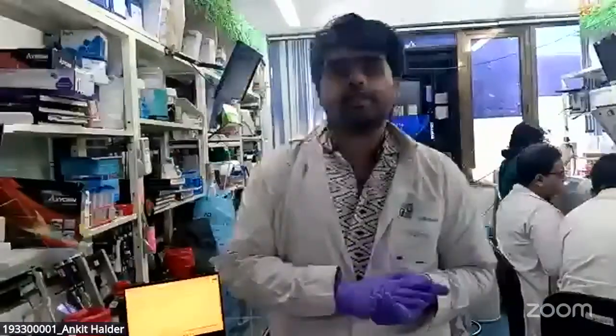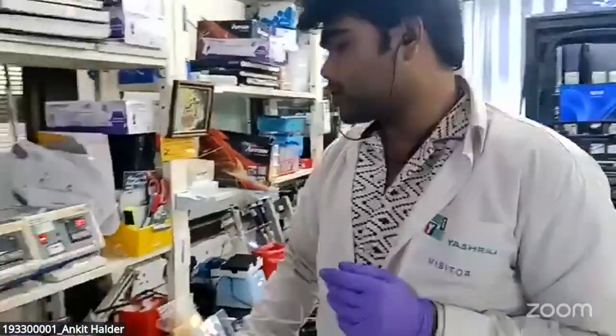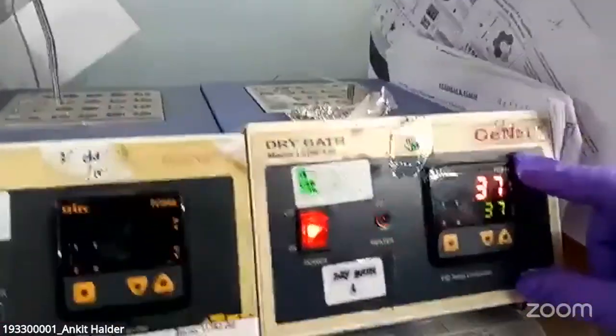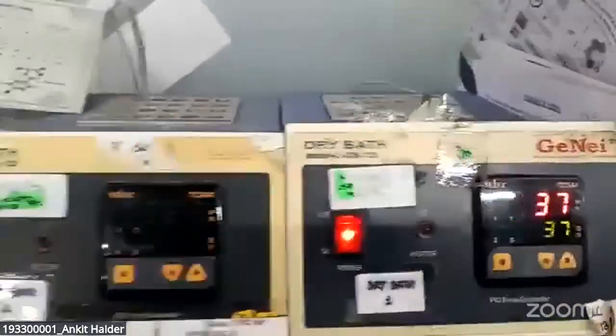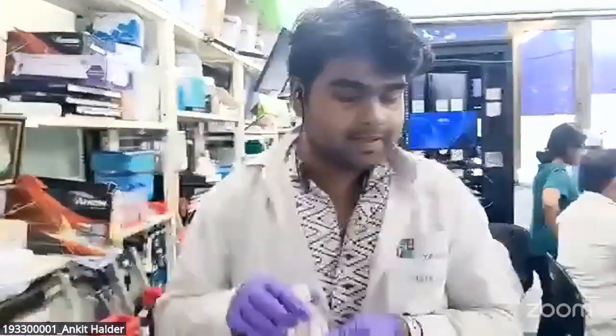Actually, in-solution digestion is quite a long process. You need multiple ingredients, and you need to keep the solution at 37 degrees Celsius for an overnight incubation. Now, whenever your digestion is complete, you need to also acidify the solution with the help of FA, the formic acid.